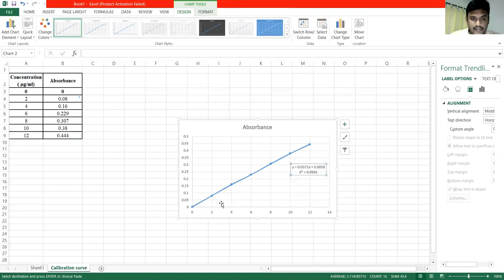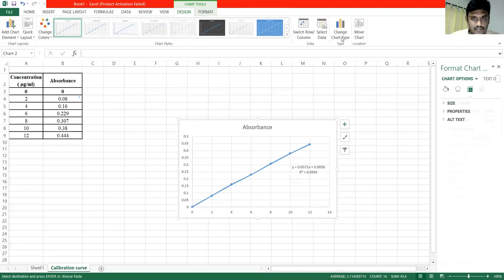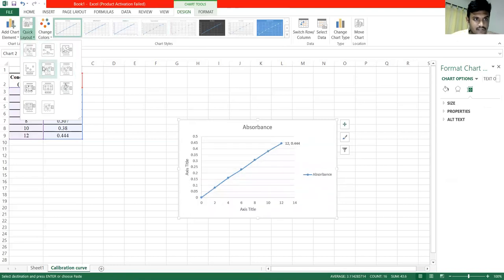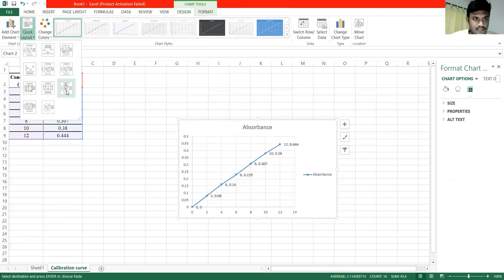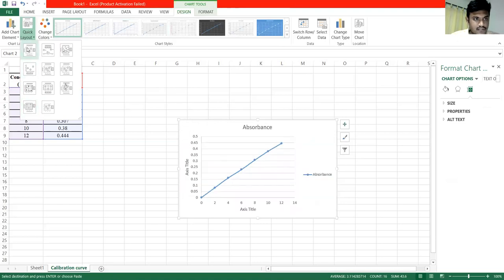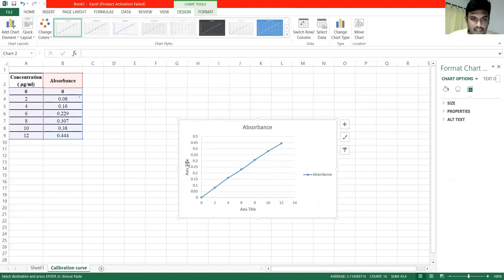Then we will choose the X-axis and the Y-axis. Then we will click on Insert. We will double-click and click on the Quick Layout. We will choose the different styles. We will select the first one, selecting the Y-axis and X-axis.